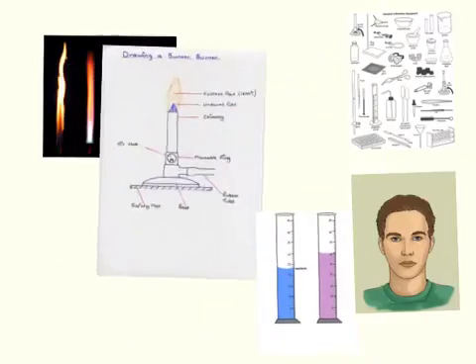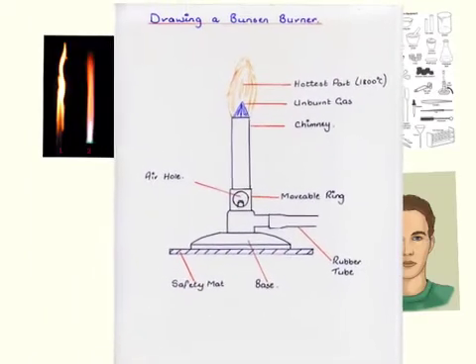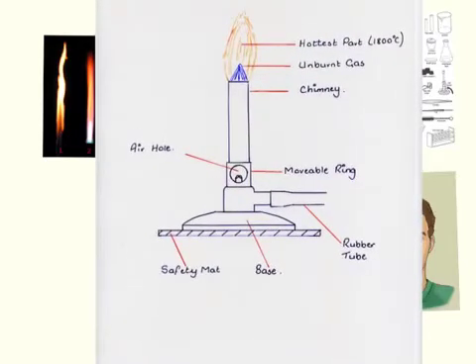Next up is Bunsen burner. Whenever we talk about Bunsen burners, they are an interesting thing. Of course, we have a combustible gas that's going through it, and it's going to be burning. So one of the things that you have to be careful of is don't put your hands in the fire. And there's parts of the fire that's hotter than the rest, and you'll notice that there's unburnt gas. Whenever we look at unburnt gas, which is right there, it's that blue cone in the middle. But right here at the top, it's right here at the top that is the hottest.